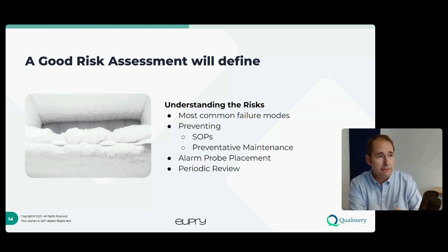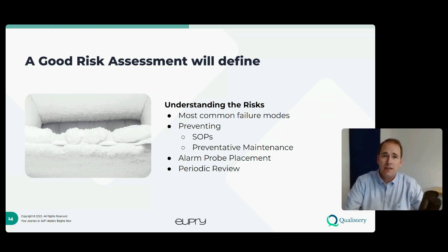So in the example of the ice buildup that you can see there, and like Jakob mentioned earlier on, if we can proceduralize with staff training and look at those SOPs and start saying, every time you open the door, look into that freezer. Is there an ice buildup? And then you can start to think, well, perhaps those staff need to be trained in seeing that, identifying it, and then resolving it. If you open that freezer every day, you tend not to see these things because it's slightly worse than it was yesterday.